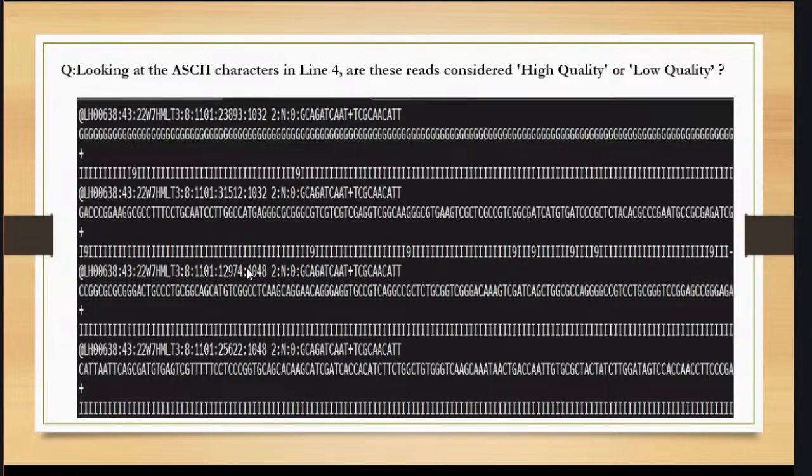In this way, you are going to filter the reads which are of good quality and you are also removing the reads which are of bad quality. And you are going to understand in the next sessions properly how you are going to use it, and also you are going to have hands on over it.